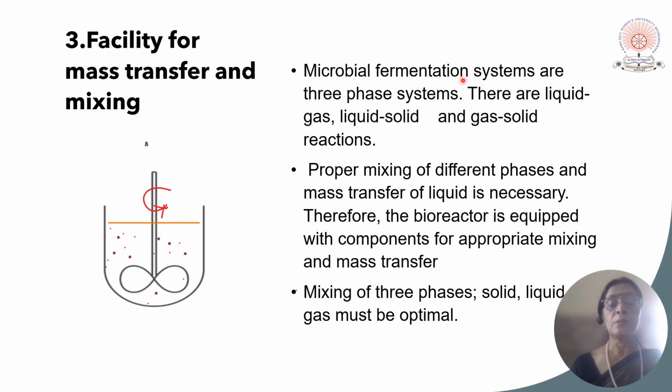Microbial fermentation systems or any bioprocessing system has three phases: solid, liquid and gas. So there are three types of reaction: liquid gas, liquid solid and gas solid reactions.